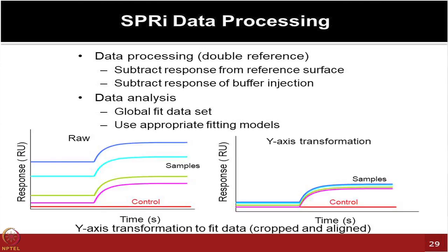In this case, for example, as I mentioned, your response timing is different because you have different molecules printed on the whole gold surface, where some start right now and some start later. So then your response units are shown differently here, but now you are normalizing all of them, and then you want to see a comparison of their responses throughout the whole experiment.